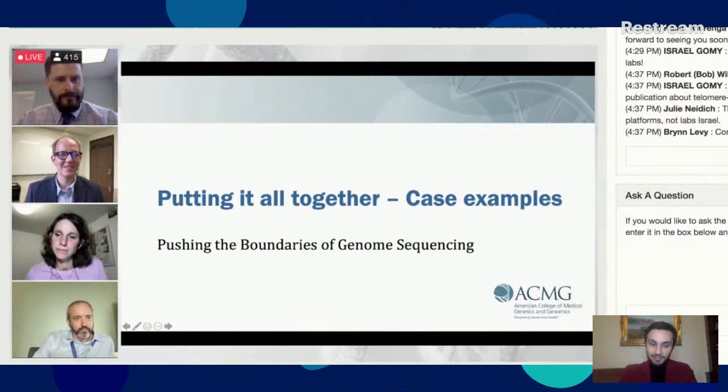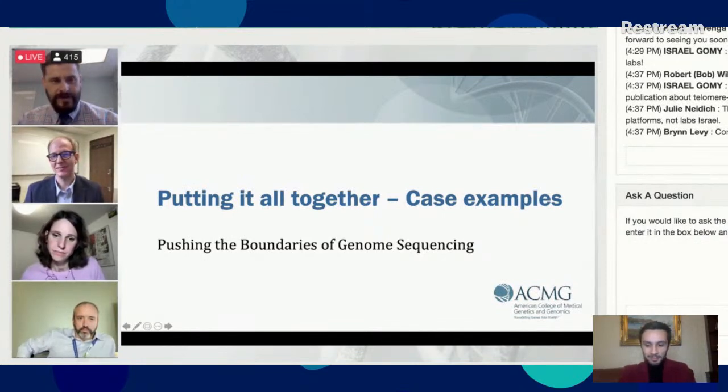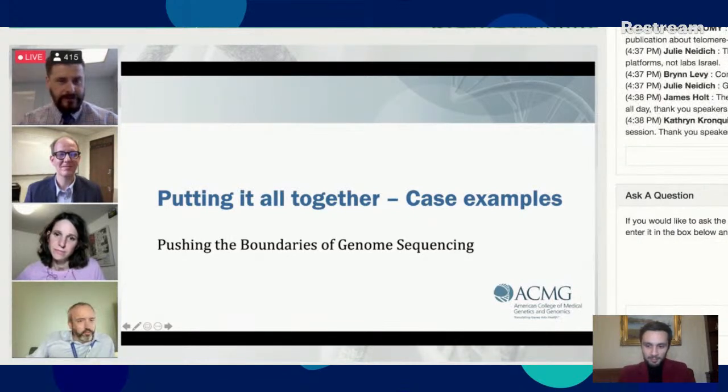So what we'll do now, I think, is go into some case examples and really see how some of these applications of genome sequencing and long-read sequencing technology can perhaps fit into a clinical workflow. So I'll turn it over to our speaker, Dr. Tucci, if you want to kick things off with the case examples.